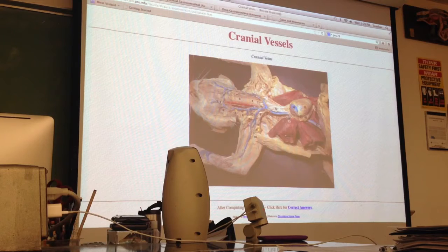Alright, the last structure we can see in this region is the esophagus. To see the esophagus, you're literally just going to push the trachea to one side or the other. So if you were to just pick the trachea up, you'll see that there's a flat, kind of looks like a brown ribbon running underneath it, a thick ribbon. That's the esophagus. Obviously it's going to be collapsed. The esophagus stays collapsed unless there's food traveling through it. So it's going to be behind this.